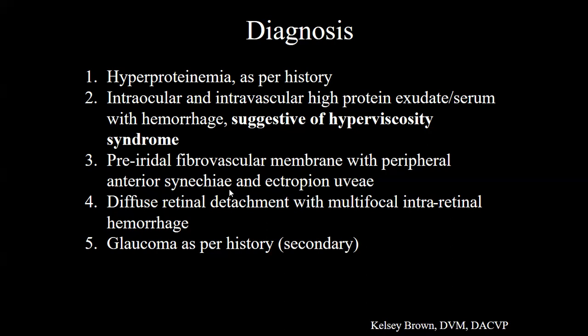You pointed out the hemosiderin when you were first introducing the globe. Do we know what the time course is for the formation of hemosiderin following hemorrhage in the eye? Good question. It's a good fun path question, I feel.